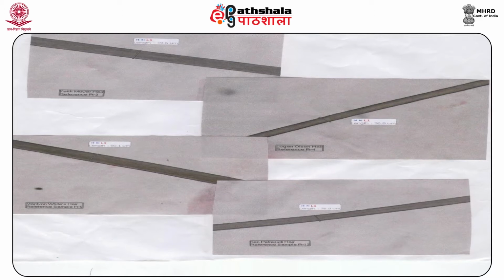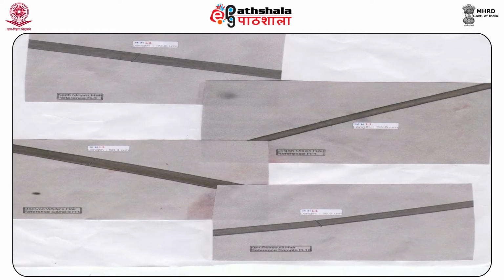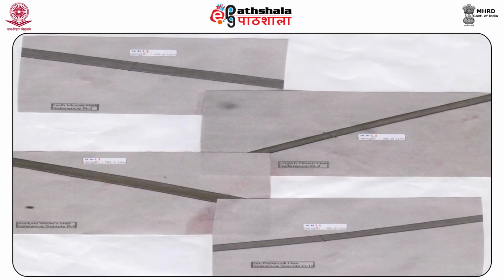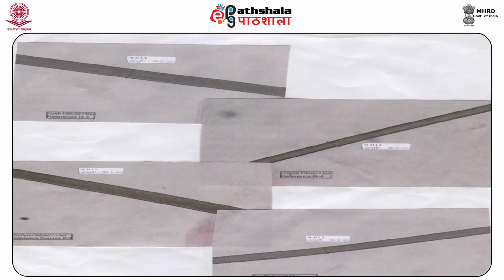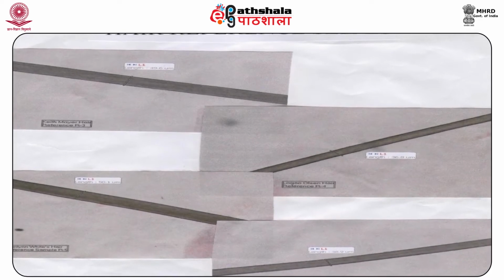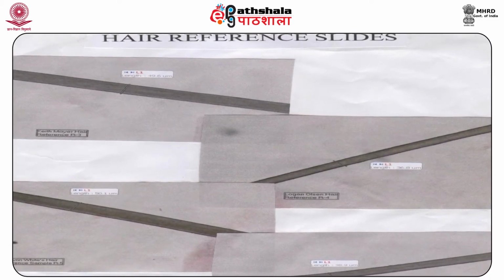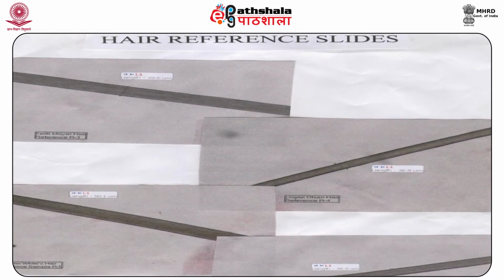In the comparison microscope, two compound light microscopes are connected by an optical bridge, which helps in the simultaneous viewing of the questioned and the known hairs. A glass microscopic slide with the known or reference hair sample is placed on the stage of the other microscope. This helps in comparing the microscopic characteristics of the known and the questioned hair samples. The range of magnification commonly used is approximately 40x to 400x.